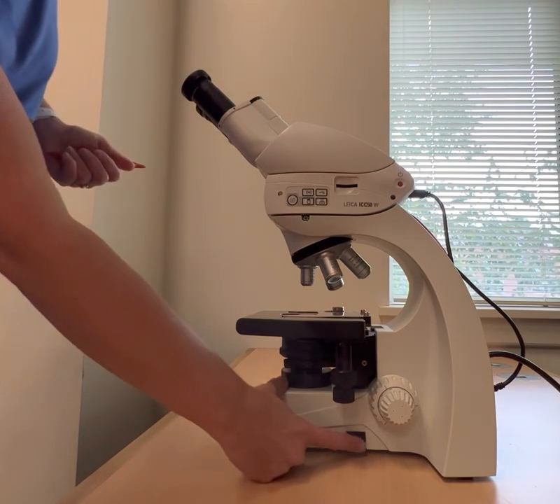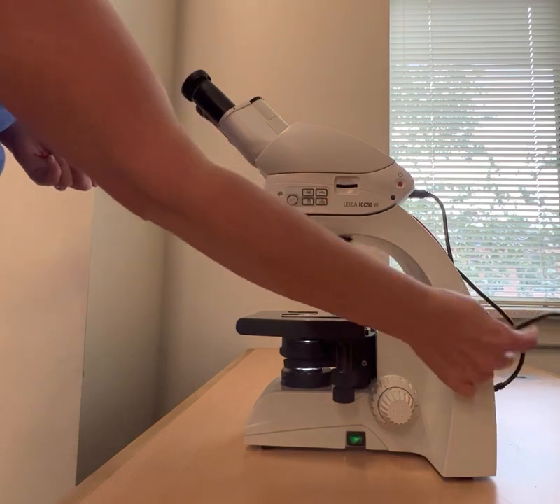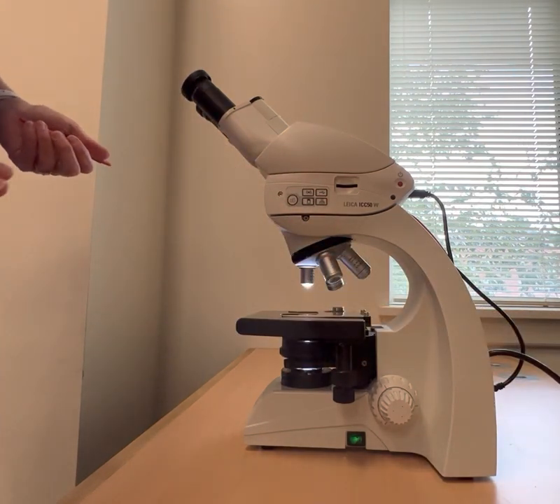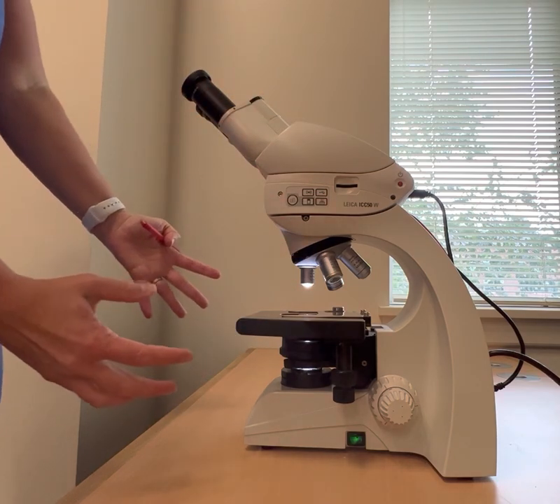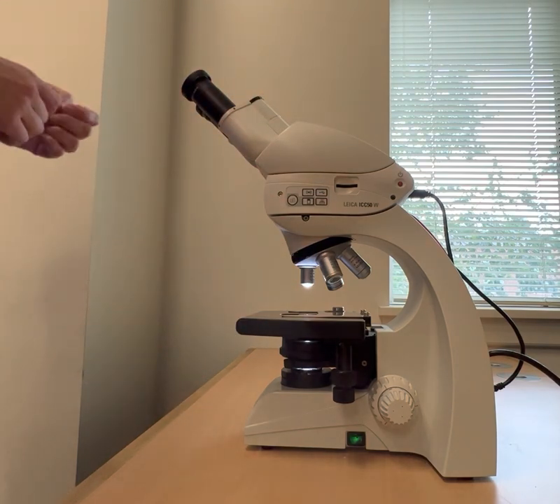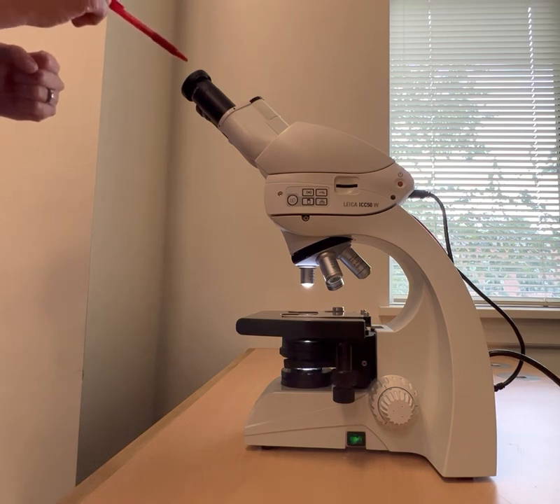I'm going to turn it on down here at my power button. You can see that it is plugged into the wall over there at my power source, and we're going to turn it on. I'm going to start at the top and make my way down. So I've got my microscope turned on, and at the very top are going to be our oculars. This is what you're going to look through.